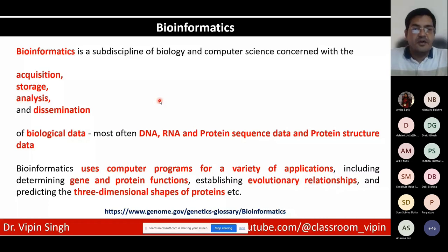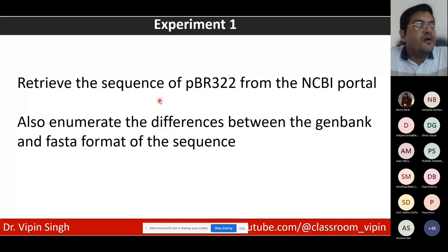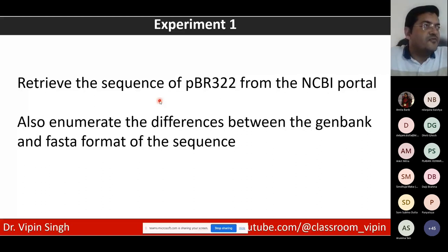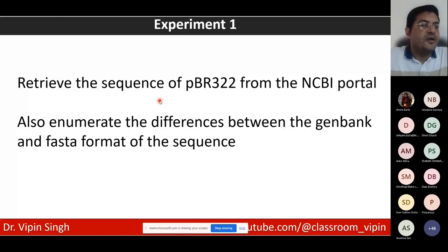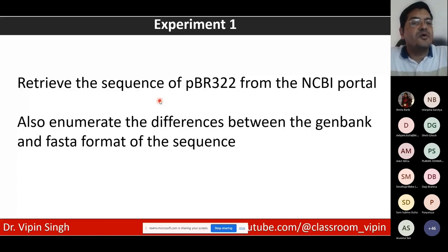Yesterday's exercise was to retrieve the sequence of pBR322 from the NCBI portal and enumerate the differences between the GenBank and FASTA formats. We have seen two different formats of the same data: the GenBank format, which has both sequence and annotation, and the FASTA format, which was the standard sequence data format until the advent of next-generation sequencing. There are also other formats available even for Sanger sequencing.